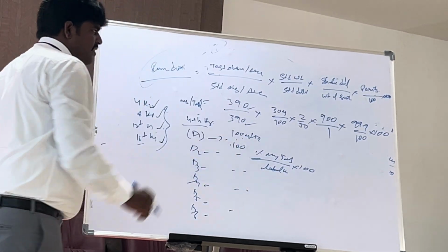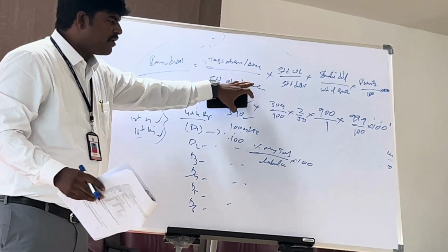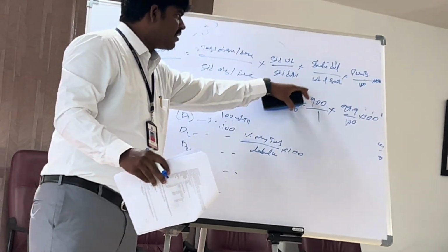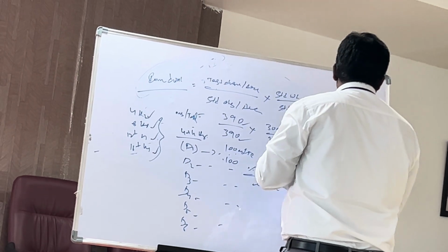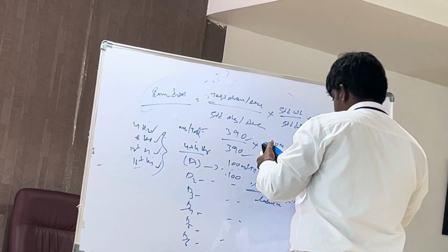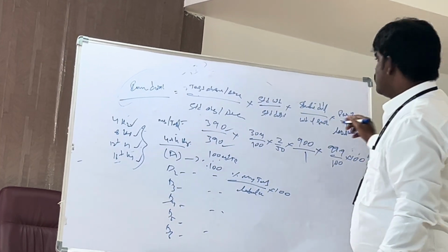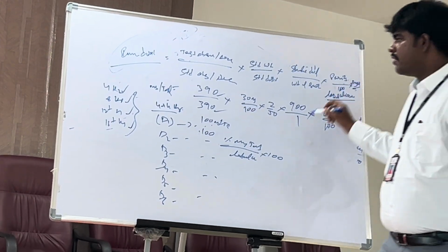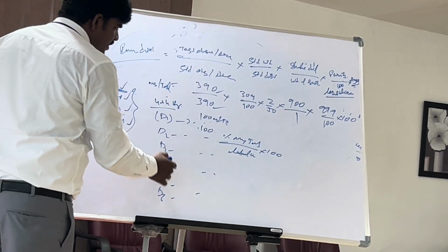Initially there is no correction factor involved in it. The formula remains the same: average weight, label claim, everything you entered here. Because mg per tablet you are not capturing, whatever the percentage you mention, you directly put the label average weight here. The average weight here is directly given as 1000 actually. Sometimes average weight may vary, so in those cases we can mention the label directly here. Whatever the initial 4th hour values you are getting, that is called D1, D2, D3, D4.